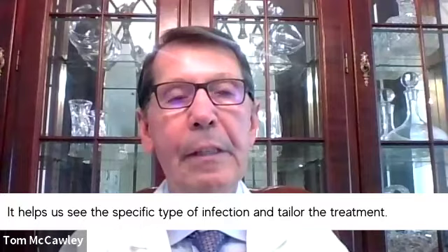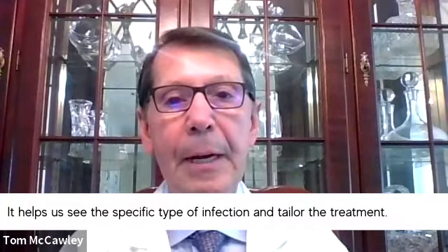What it does is it helps us see the specific type of infection, as Steve said, and tailor the treatment, and also, importantly, tailor what antibiotics to use. For example, if you see amoeba in there, you know that penicillin alone won't treat the disease. You need an additional antibiotic.